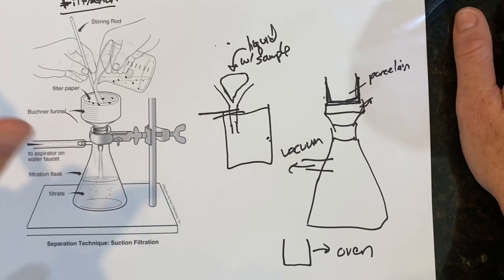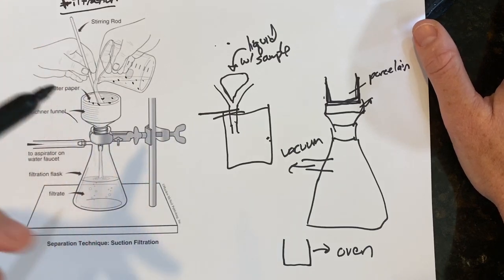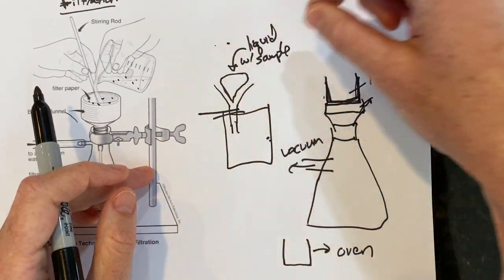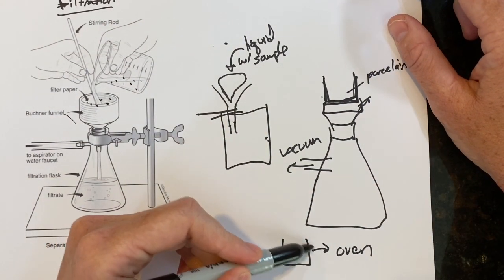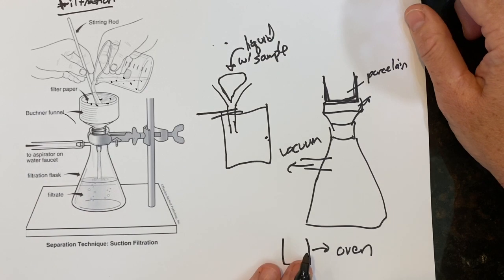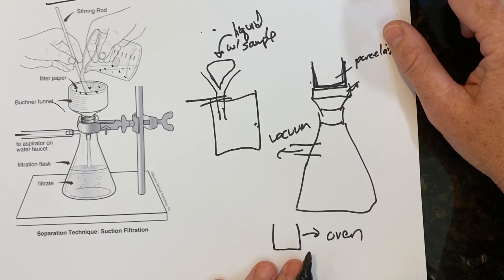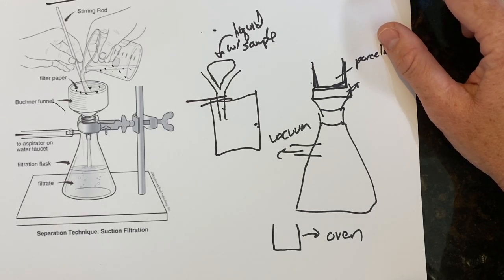it can tear. Two, it can break open. And three, you have to find a way to take this sample out, unfold it, and put it in the oven. Then we have this situation where we have a crucible. Crucibles work really, really well because you can throw it directly into the oven and figure out what exactly you had in there, exactly how much of something you had in there.